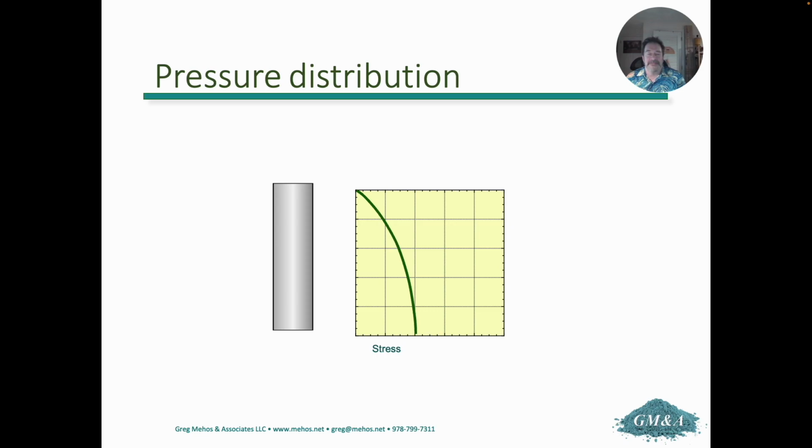First of all, it turns out to be rather small compared to a liquid. For a liquid, we would have had to extend that line. For solids, the maximum stress is a lot lower. And you also notice that you get to a point where it really doesn't depend on the height anymore. It's more related to the diameter.